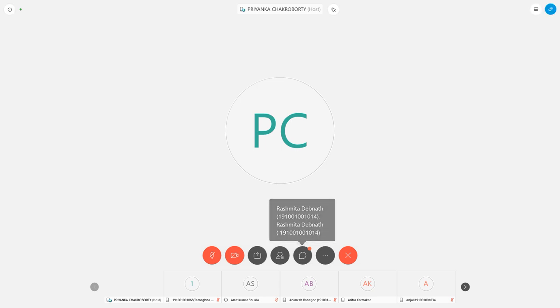So silver mirror test is also a very good test for aldehyde identification, but we prefer to do the Fehling's reagent test because it is a cheaper reagent that is available in our lab. So you just go through the video demonstration, just get the visualization how you can detect by simple qualitative identification of the functional group.